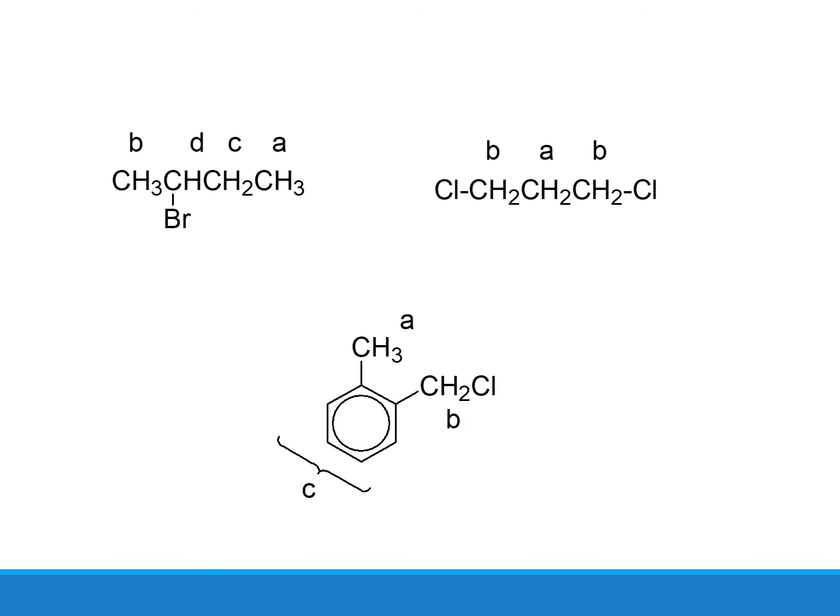Similarly, these are the answers to give you a better understanding of the NMR of an organic compound, and it's good to practice this spectroscopic identification with different examples, and that's why many of the spectroscopic lessons include practice exercises, right?